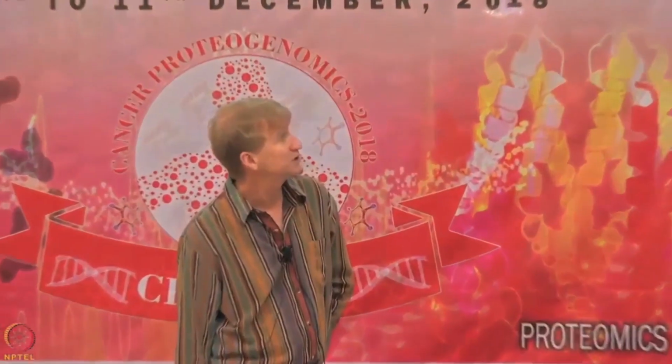It takes a lot more time to do an experiment this way, a lot more instrument time. Here, there is some loss of accuracy in the quantitation due to compression that I'll talk to you about. The reagents can be expensive. Here, you have less potential for plexing.